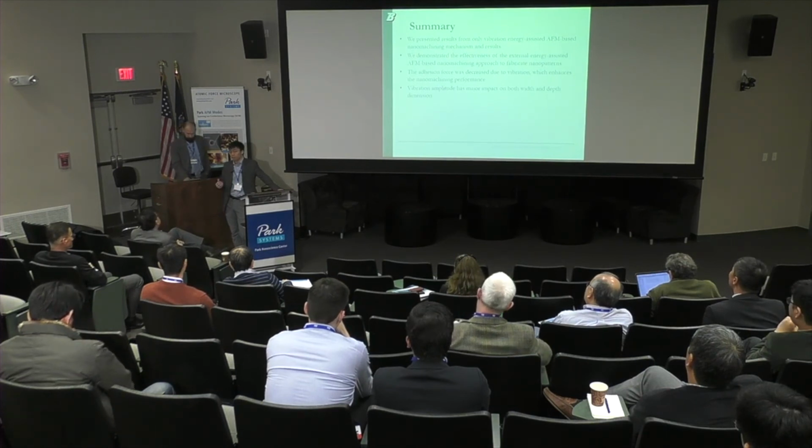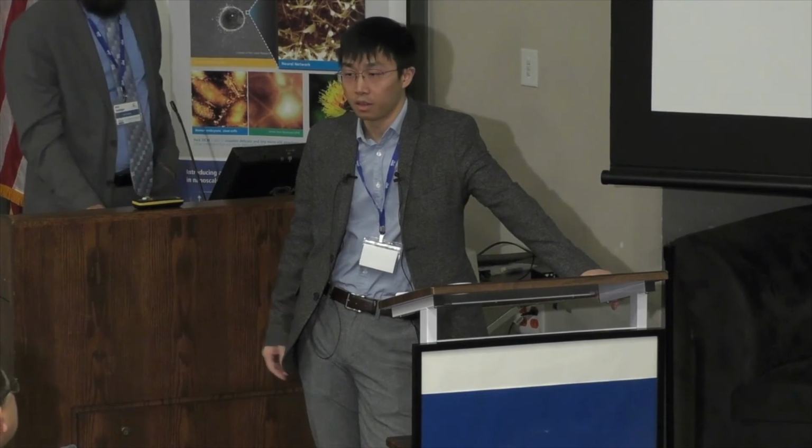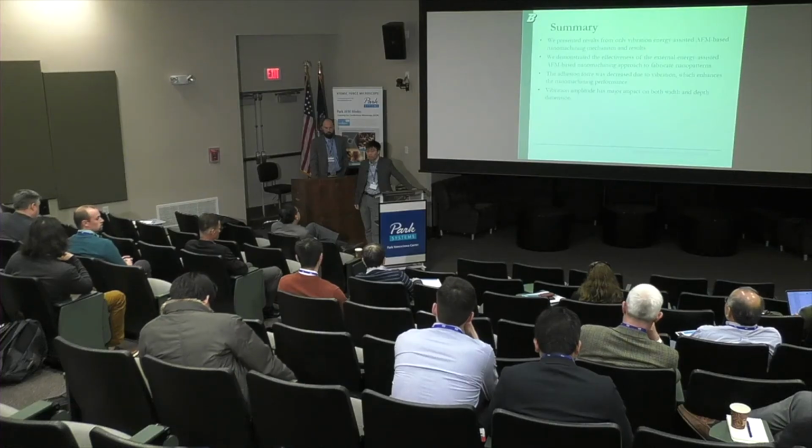Yeah, the tip material, the soft tip, is just silicon itself. And the very high spring constant tip is DLC, diamond-like carbon, coated tip. The substrate is polymer, I would say any polymer. Now we use PMMA. The glass transition of the polymer is also very important. Glass transition usually is about 100; for example, PMMA is about 100 to 105.